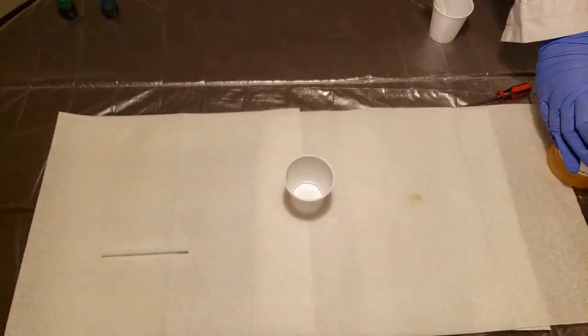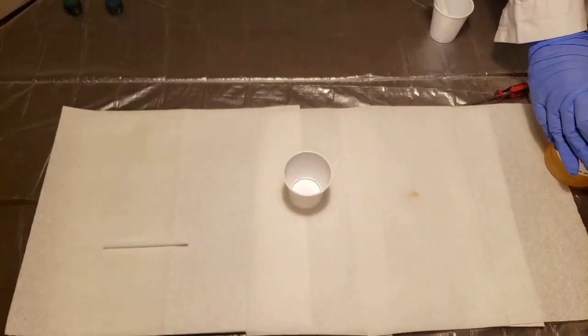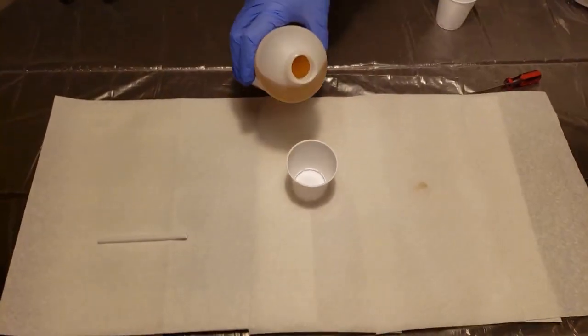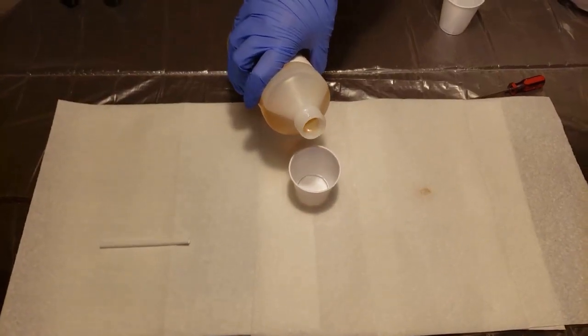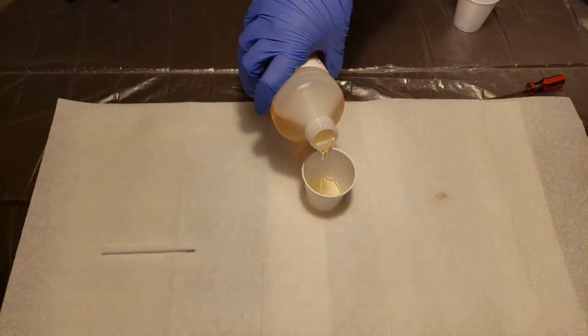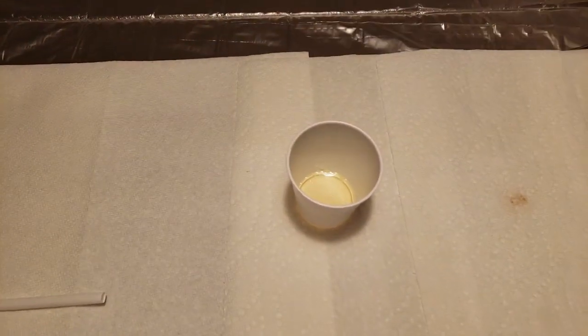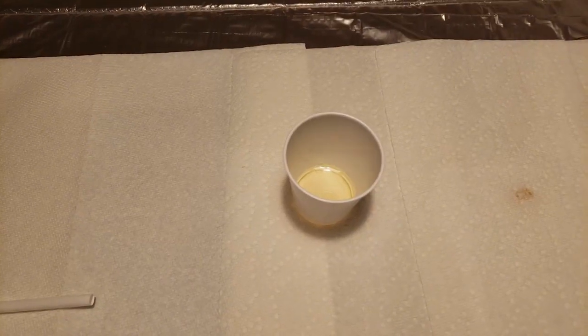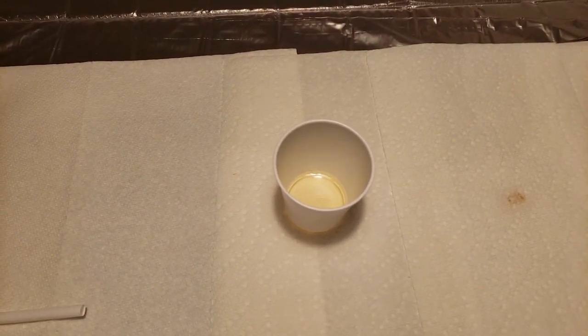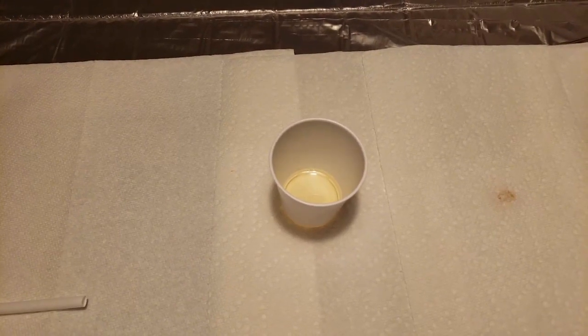The first chemical we're going to use is actually part of our polyurethane foam. We're going to call it part A. So as we pour part A, make sure that you write down any properties and take note of things that you see about it. You can see that it's a nice clear liquid. It is pretty viscous — it's kind of like syrup.